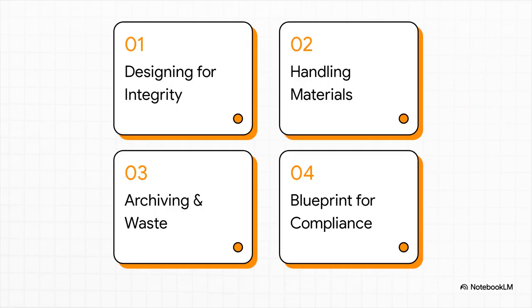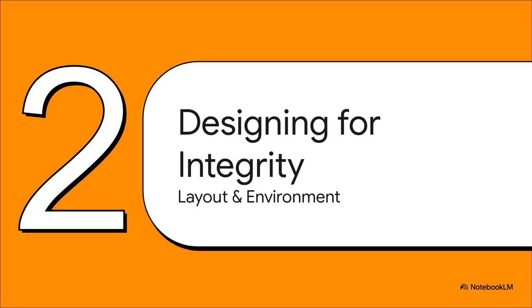So to get Apex Labs back on track, and to show you how to stay on track, we're going to zero in on these key areas of facility management. And we'll wrap it all up with a clear blueprint for success. Okay, let's dive right in. First things first, we have to look at the core layout and the environment of the lab. Believe it or not, the way your facility is designed has a direct, and I mean direct, impact on the integrity of the data you produce.